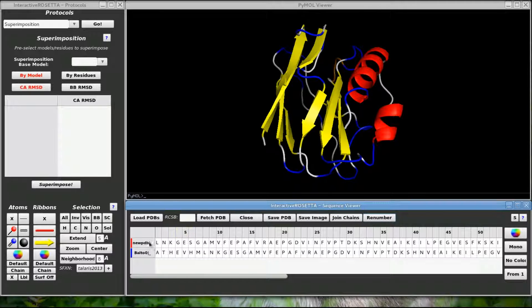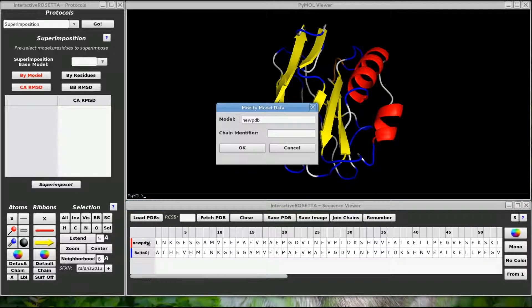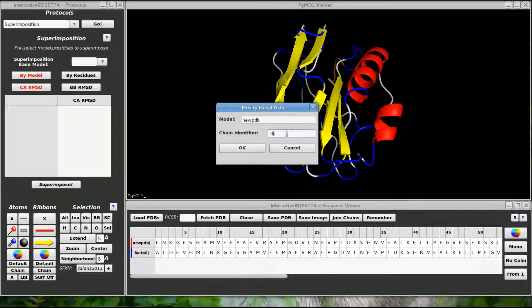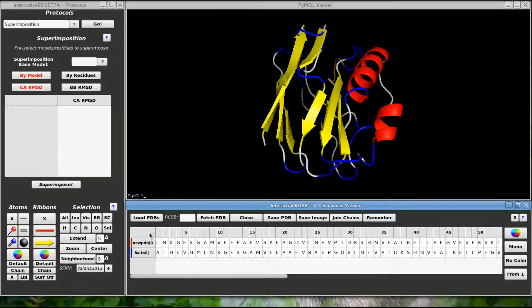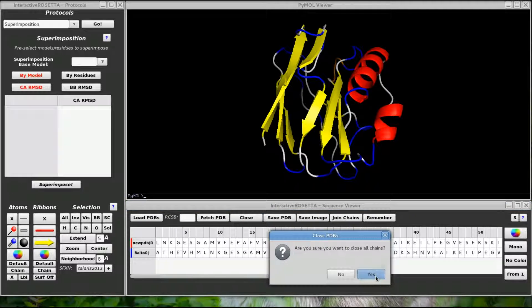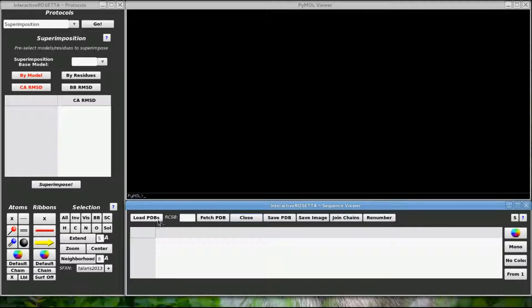If I right click on a chain label over here, I can modify the model name and or the chain identifier. So let's change the chain ID to R, for Rosetta. Okay. Let's get rid of that chain and now I'll show you something cool.